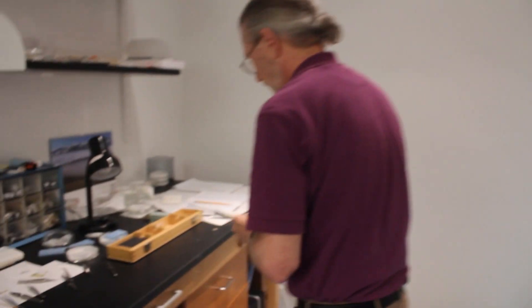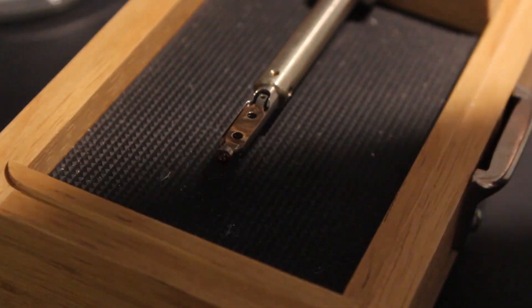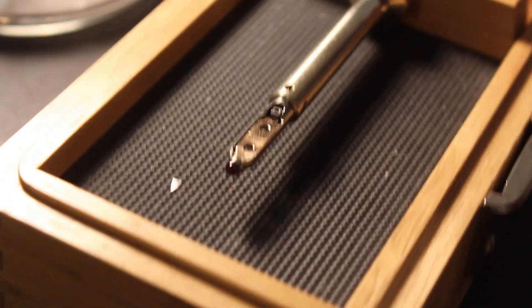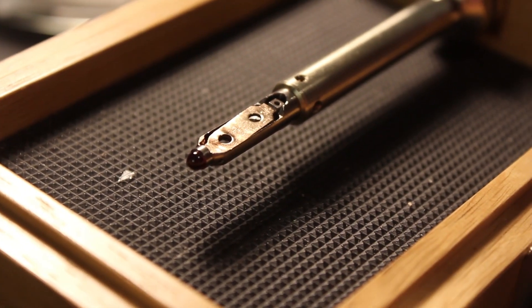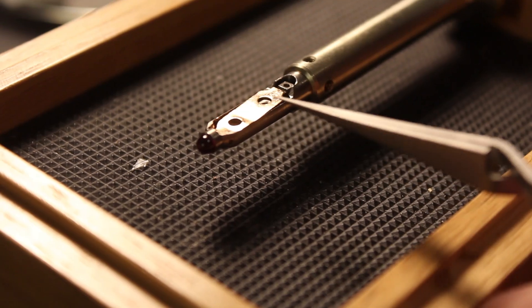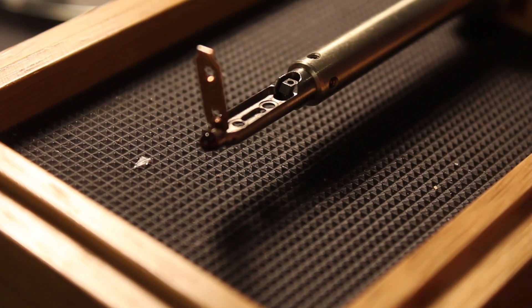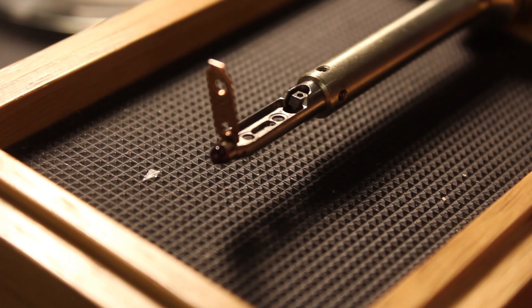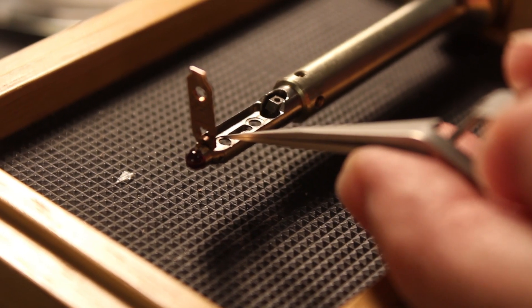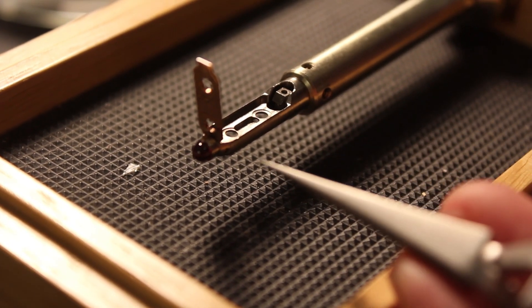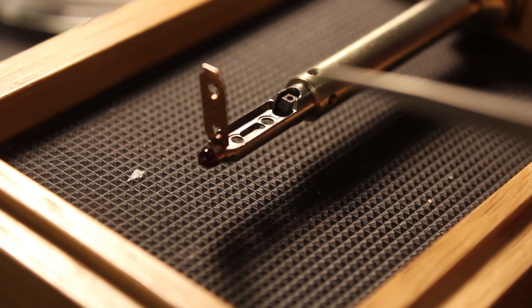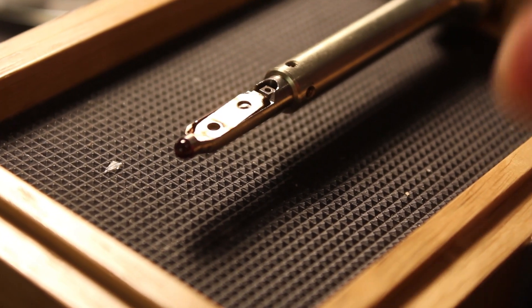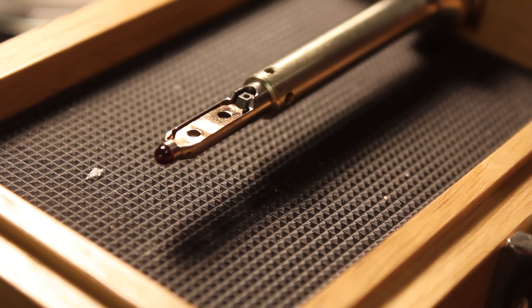Is that a ruby tip on the end? Yes, that's a ruby. It looks like something I've seen in metrology, coordinate measuring machines. What's the intent of the ruby? It's a very hard material. And so you index on the ruby every time? Yeah, there's a fitting inside the microscope that that ruby fits into so that you know that these two holes are exactly where they're supposed to be. It's a mechanical index that's a gem. And you see the little recesses right here? The grids fit down in those. There's a little rim right here on the inside of this hole that fits down on top of it. So when you put your grids in there, they're held in place.